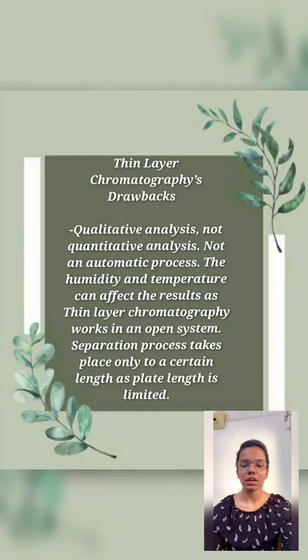Qualitative analysis and not quantitative analysis. Not an automatic process. The humidity and temperature can affect the result. As a thin layer chromatography works in an open system. Separation process takes place only to a certain length as plate length is limited.